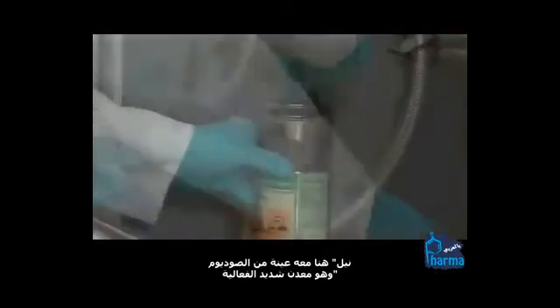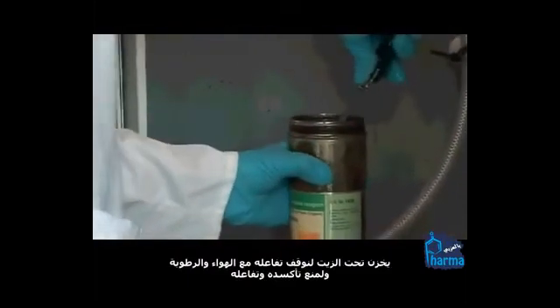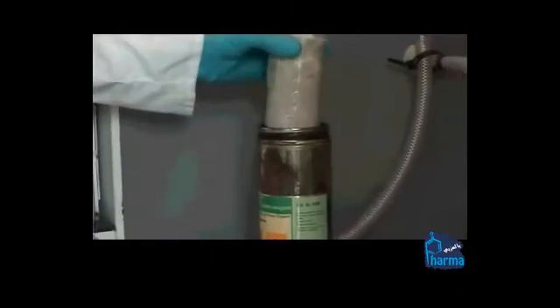Neil's got a sample of sodium. Sodium is a very reactive metal. It's stored under an oil to stop air or moisture getting on it, to stop it oxidising, stop it reacting. You can see it's a very soft metal. He's going to put his knife in and withdraw the lump of sodium.